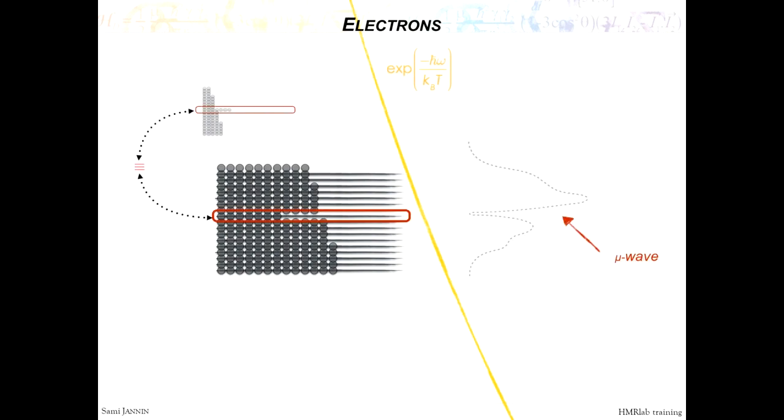So in terms of energy level, this means that some of the spins are saturated, and so for those spins you equalize the population, spin up and spin down. But for the other ones, they're not affected. Okay?